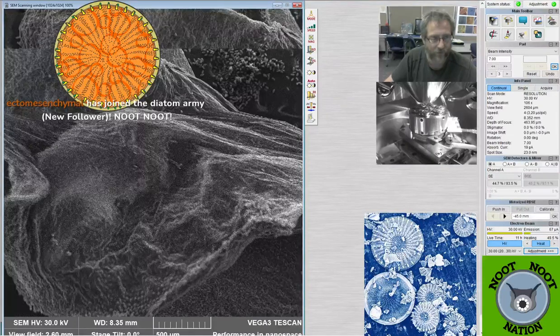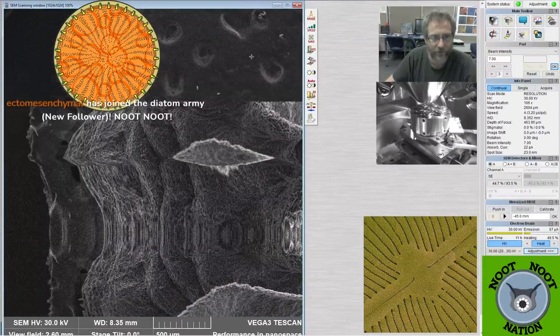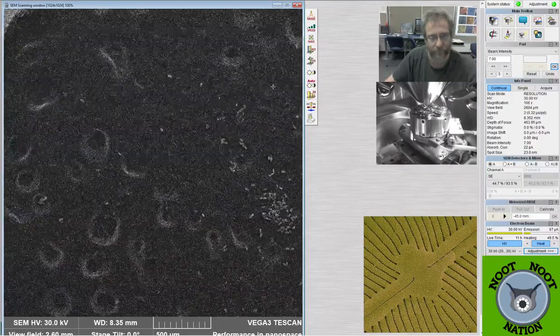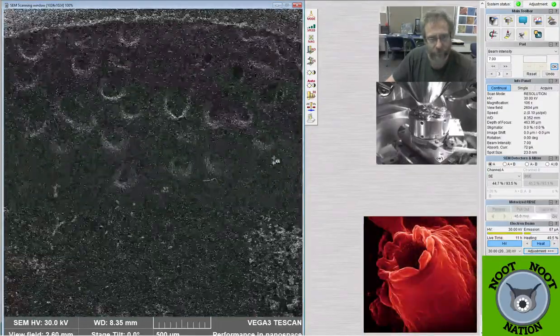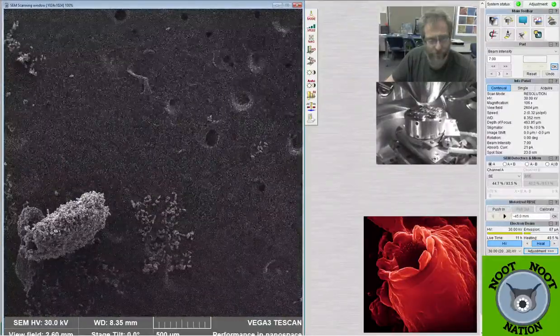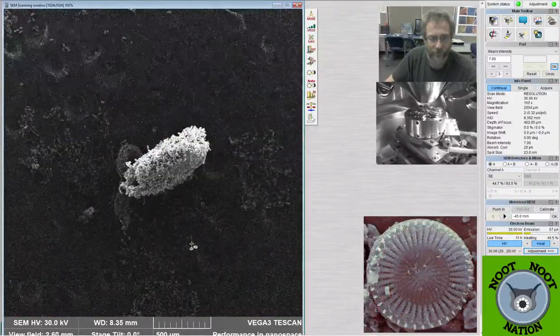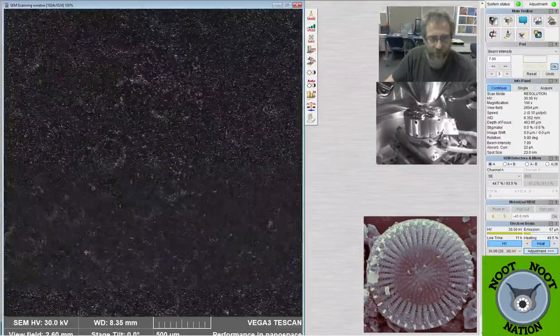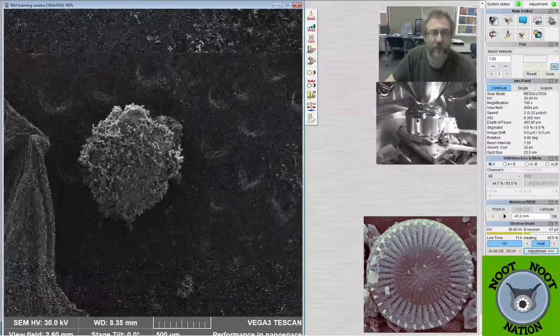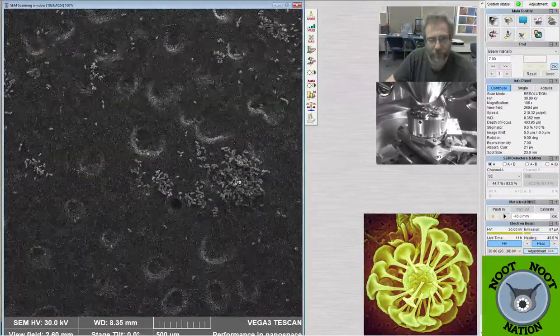And I think maybe there were some, so these are the petals. And I think somewhere in here I also stuck down one of the anthers or a couple of those as well. Tried to, anyway. It's kind of hard doing surgery with scissors. And here's one of the anthers. That's the thing that's generating the pollen. Scissors, and there's another one, tweezers, right? So I had to get them onto this stub somehow.